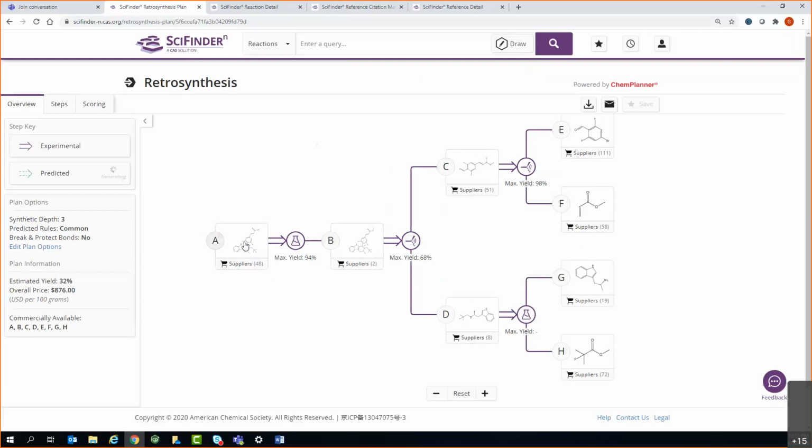So we're taking this molecule and converting functional groups and disconnecting bonds till we get back to reasonably priced, commercially available starting materials. And what is reasonably priced? That's $1,000 per mole or less. And for each of these transformations, we pull out the literature. We look to see if there was a yield associated with it. If there was, we associate that yield. If there's not one associated, we put in 50% as a placeholder.